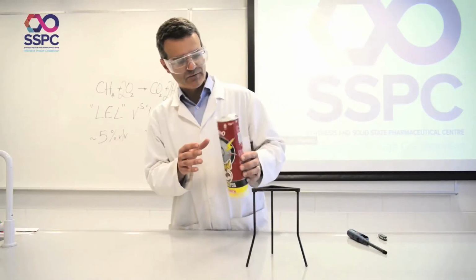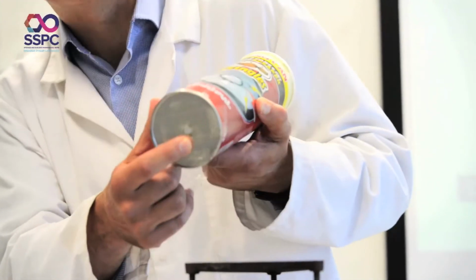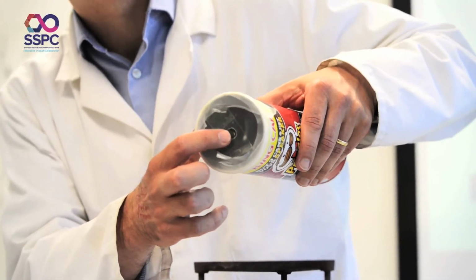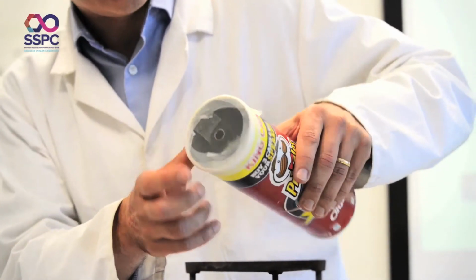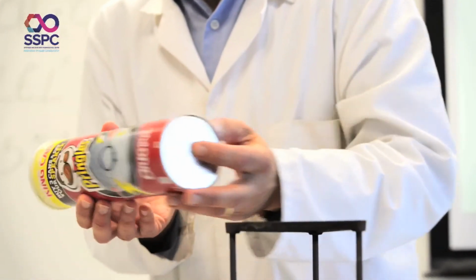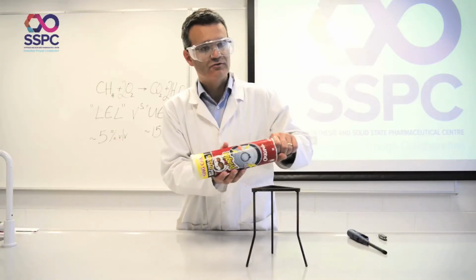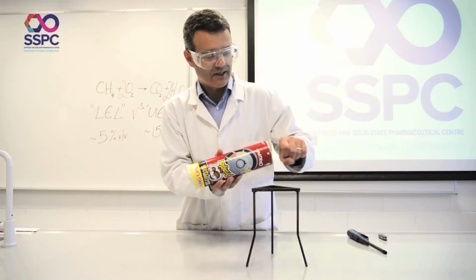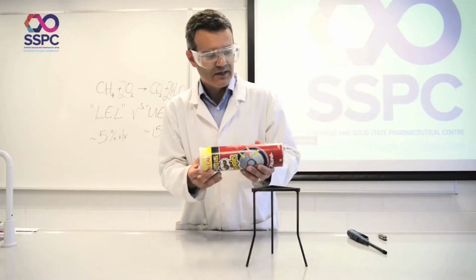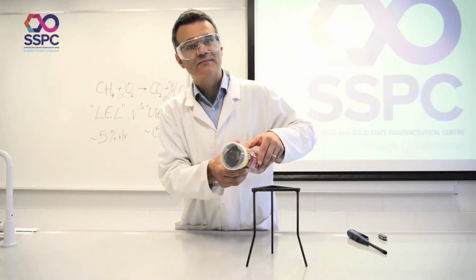The idea here is that I've pre-filled this with some methane. I have a Pringles tube here with a hole in the bottom of the tin and a hole in the plastic lid of the tube. Without the parafilm and without the sellotape on each side, I had just a rubber hose, and I blew through from the tap 10 seconds worth of methane, just let it blow through, and then I sealed it with some sellotape on either end.